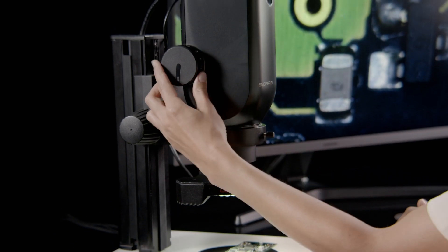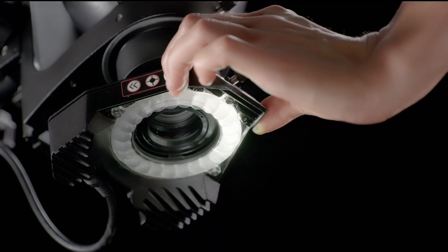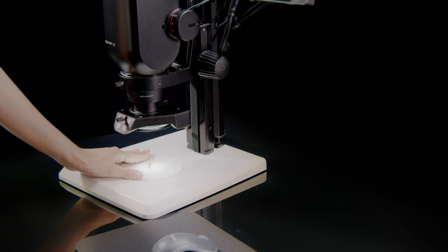Go smoothly from overview to details. Choose the illumination that works best with your samples, and with the setup that best fits your inspection needs and work environment.